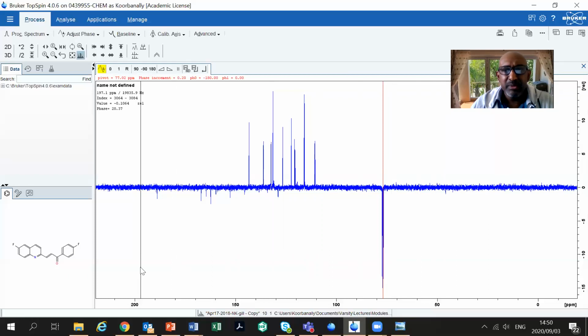All right, so this is my carbon-13 NMR spectrum. If I look at my structure, I've just got aromatic peaks here. I've got a carbonyl peak. You know, your carbonyl peaks are roughly around 200 or so, probably this one here. So I'm going to look at peaks, and then I'm going to expand this region again, from there to there. Before I expand that, can you see this peak that we have here?